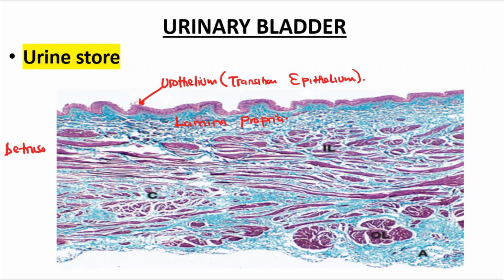The detrusor muscle has got 3 muscle layers. This you must know.